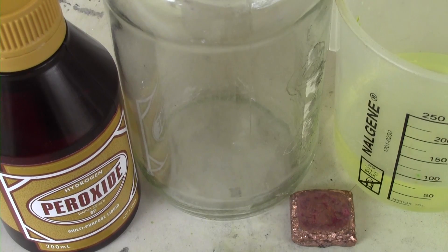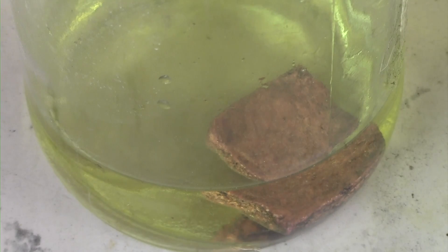The third method will be using 3% hydrogen peroxide along with a bar of copper metal and some hydrochloric acid. Hydrogen peroxide is needed to react with copper to form copper oxide, which then reacts with the hydrochloric acid to produce copper(II) chloride.